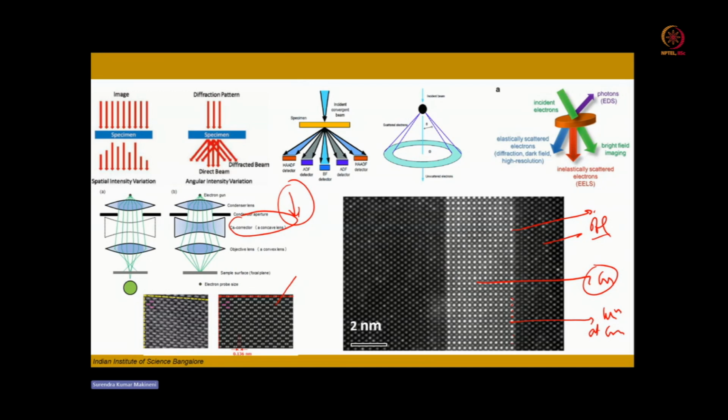With this, I will end this class now. Briefly, I have gone through some basic methods which can be used with the scanning electron microscope, in correlation with the transmission electron microscope, and how these can additionally be used with atom probe tomography. I will give you a brief example with certain applications related to some structural materials in the next class.